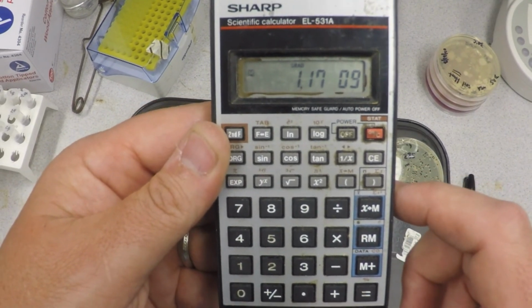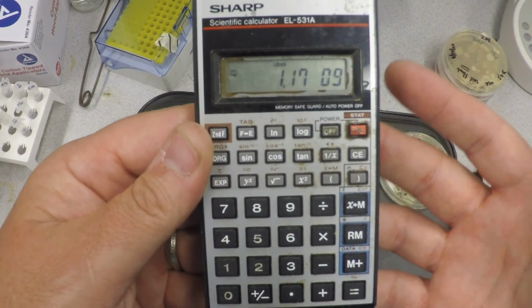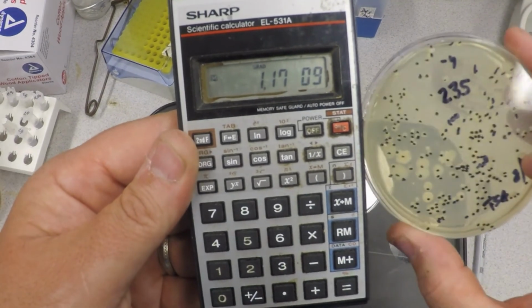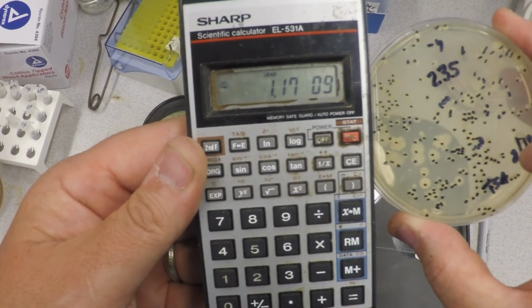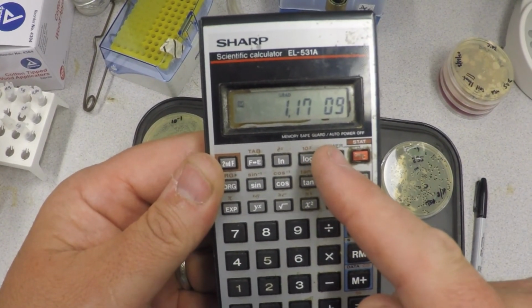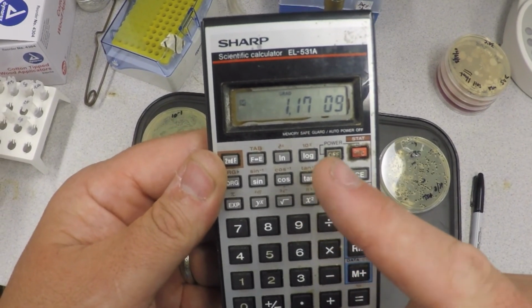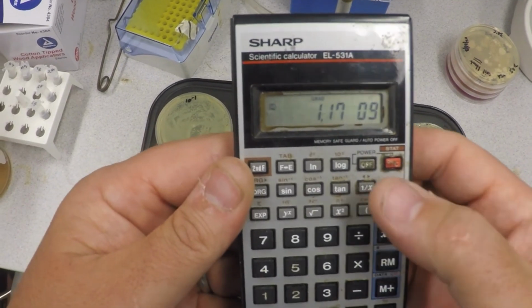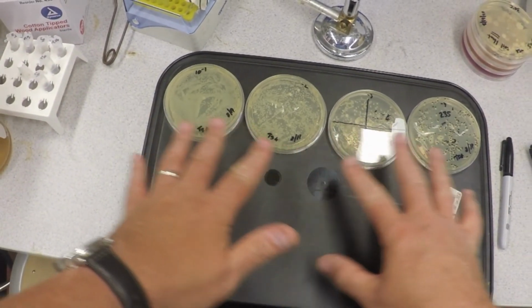Okay, so I want you to think for a little bit why that might be. Obviously, this one is actually more realistic because this is what you see, this is what you count. These are actual viable cells. So I want you to think about why you'd get a number from the spec reading using a little spectrophotometer that's grossly overestimated. Okay, so think about that a little bit. But overall, this shows you the basics of how this works, and it worked really, really well.